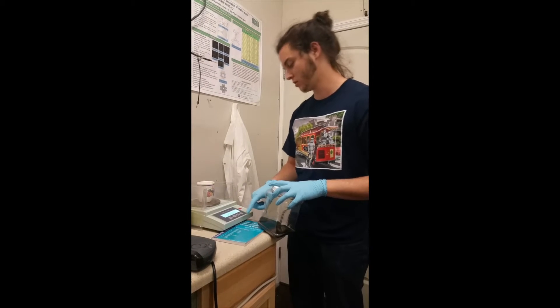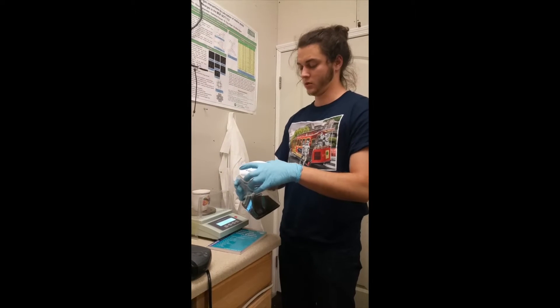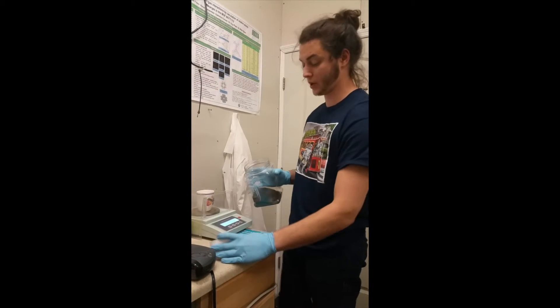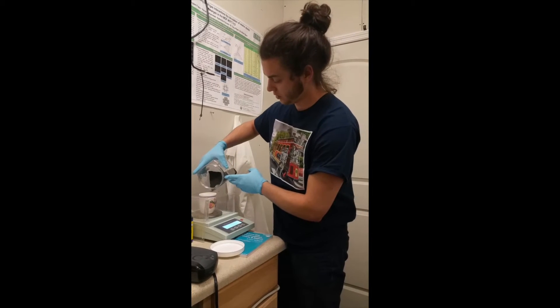I'm going to use my mass balance and measure out roughly 50 grams of the potassium permanganate into the container.